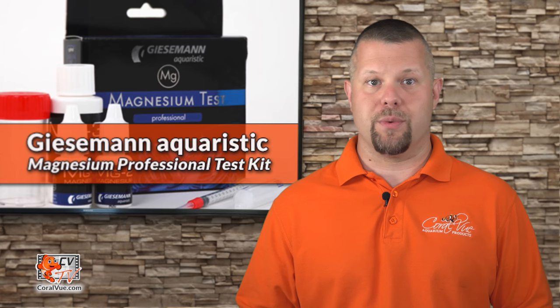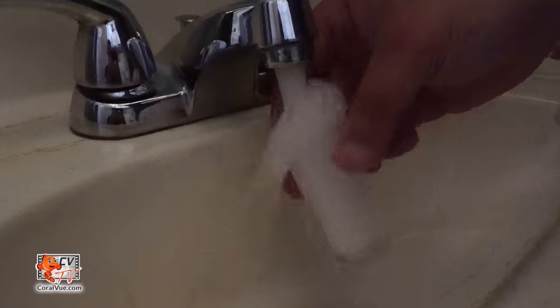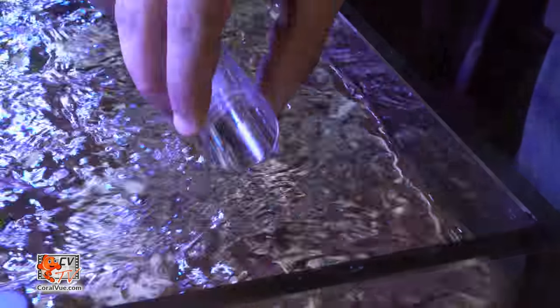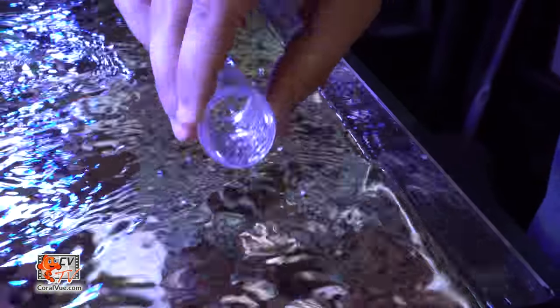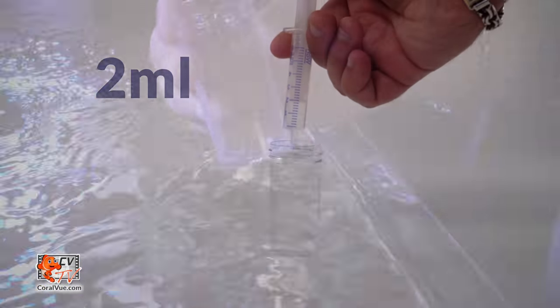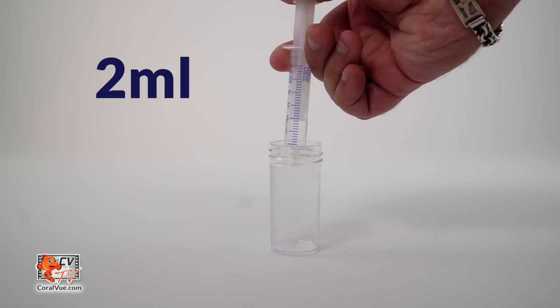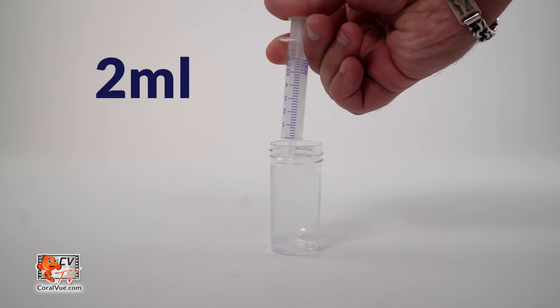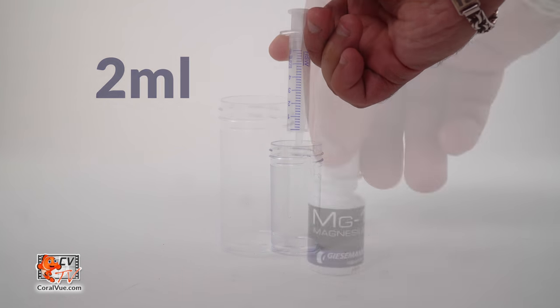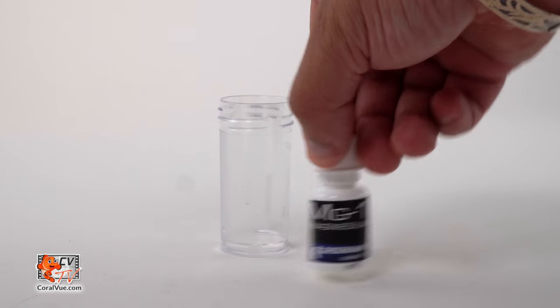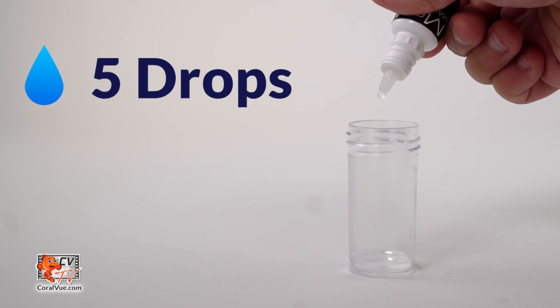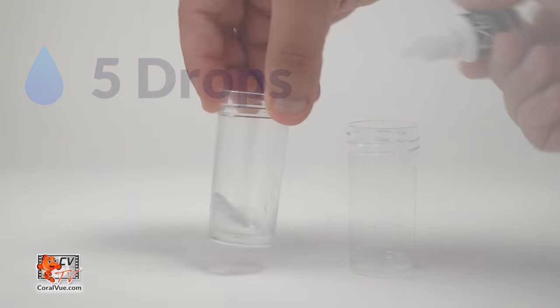Giesemann magnesium test kit is rather simple to perform. Rinse the test vial in running water, then rinse the vial several times with aquarium water. Once fully rinsed, fill it with two milliliters of aquarium water using the included syringe for increased accuracy. Carefully shake the MG1 reagent and then add 5 drops to the test vial and swirl for 20 seconds.